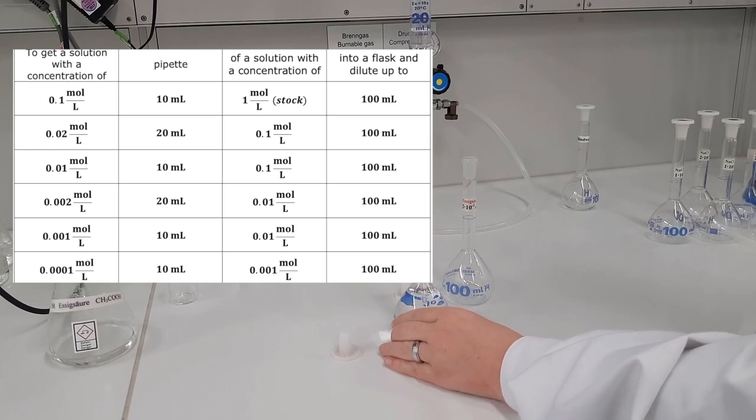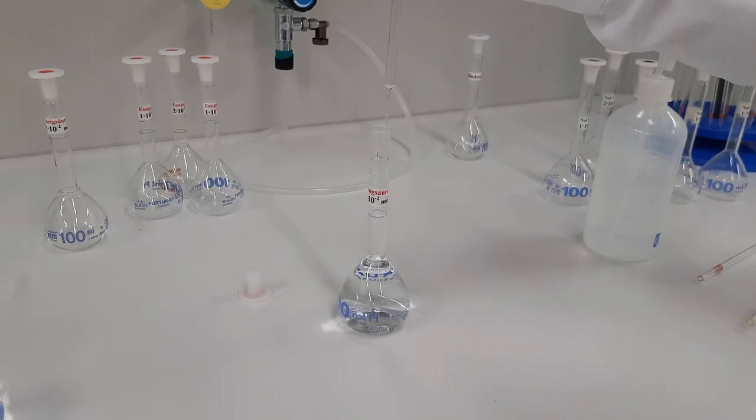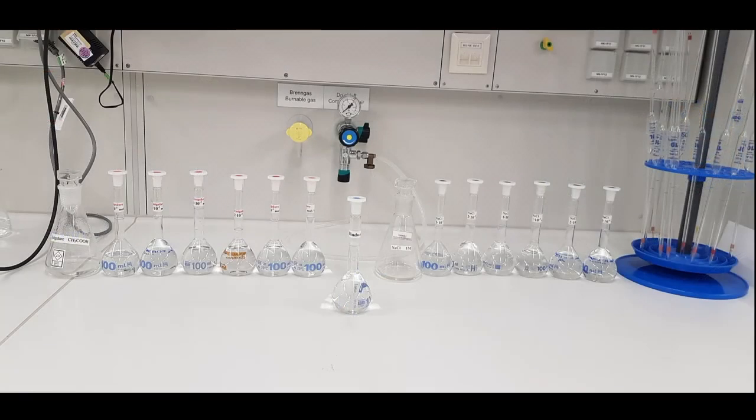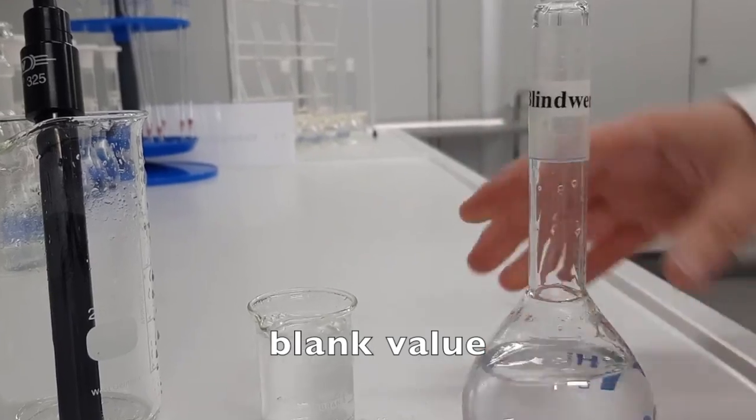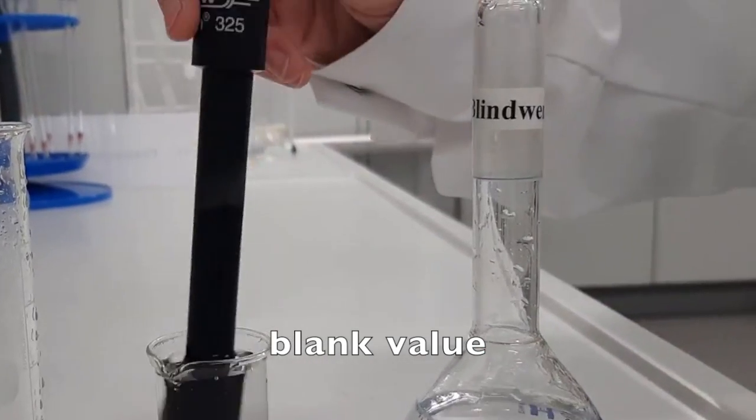During the preparation of the samples, CO2 from the air will inevitably dissolve in the solution. This systematic error can be taken into account by measuring a so-called blank value.